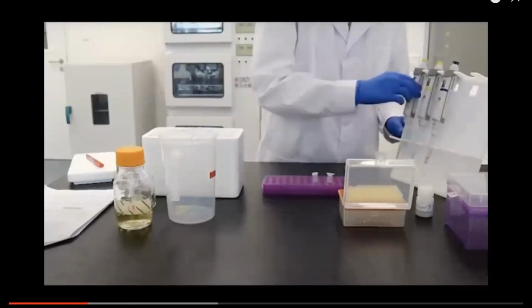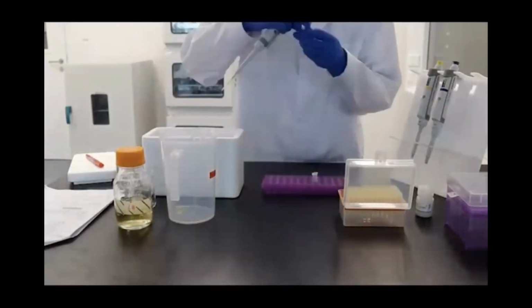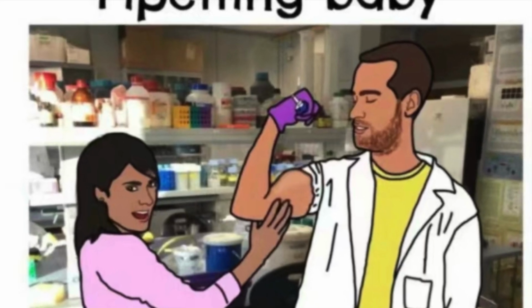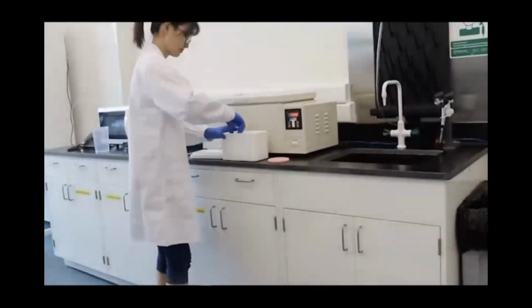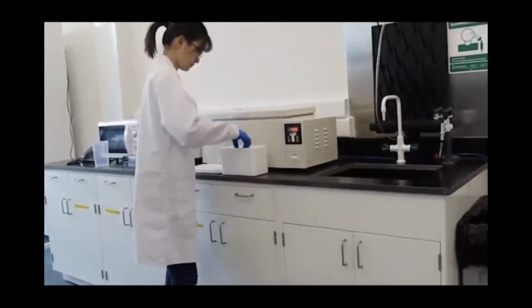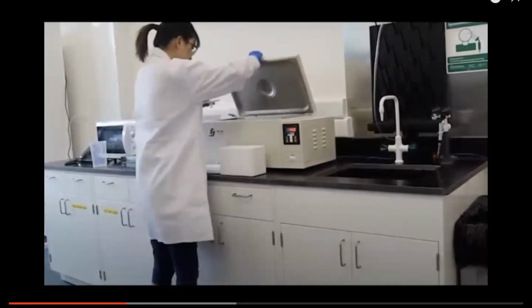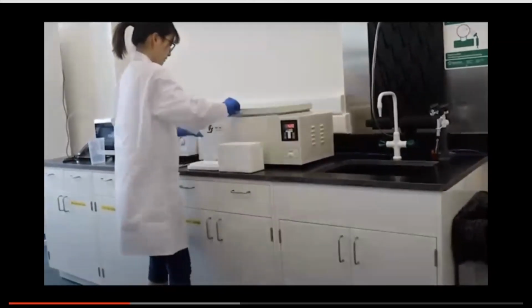Let's see the procedure of this lab experiment. We first label two tubes, plus and minus, and agar plates according to plasmid content. And then we thaw chemically competent cells on ice. Transfer cells to labeled tubes and add plasmid to the plus tube. Then we incubate tubes on ice, move to a 42 degrees Celsius water bath and return to ice. We add LB, seal plates with tape and incubate upside down.